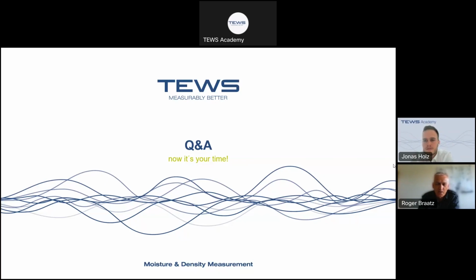So first you need to select the right brand settings from our library, and then you can measure a batch of only this kind of sample. Mixing doesn't make sense because we don't automatically switch specifications during the measurement. Okay, so choose the specifications and stick to it.